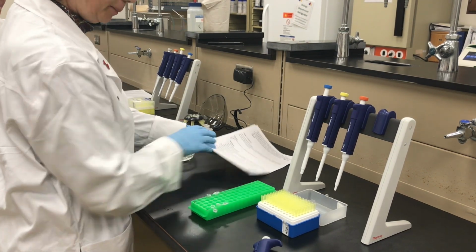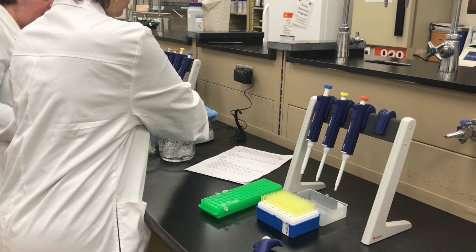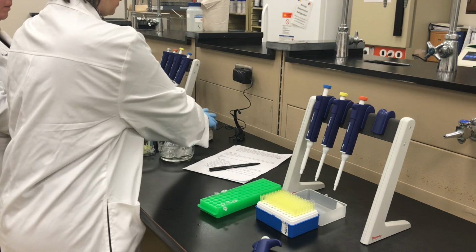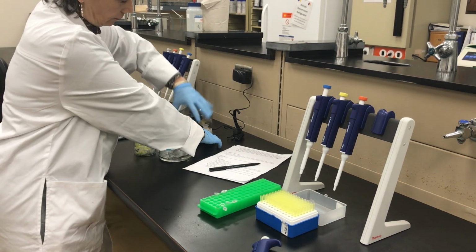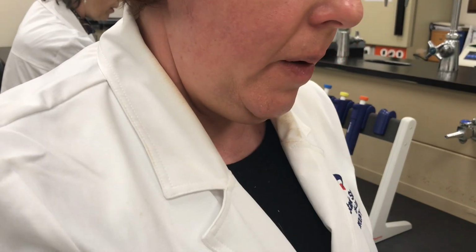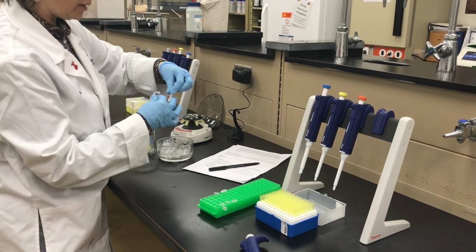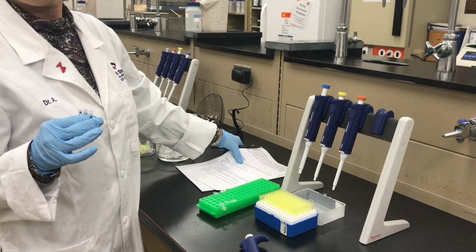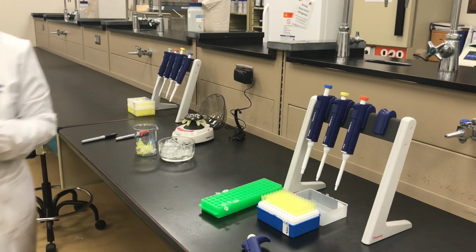Some paper and a pen, so you can write down what order we put them in the machine, because we've labeled them. And negative, and then the star is being positive. Yes. Okay. Take our 4 tubes over.